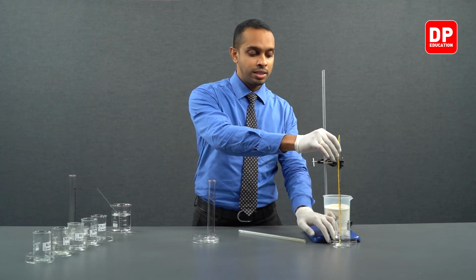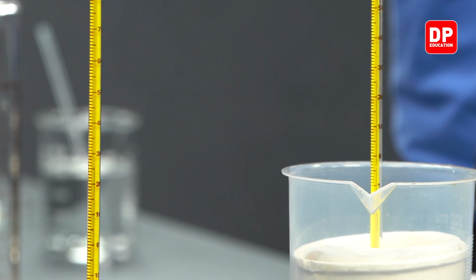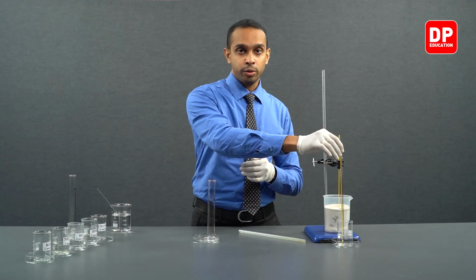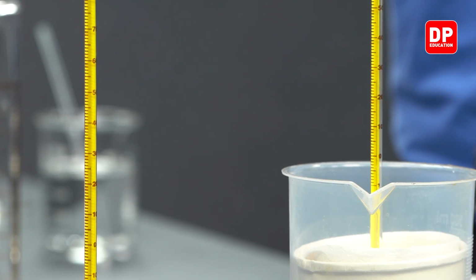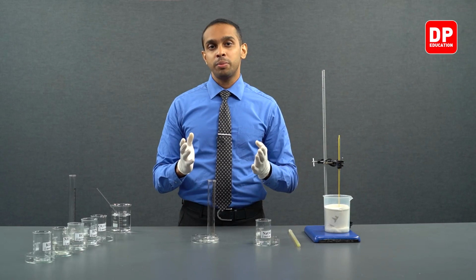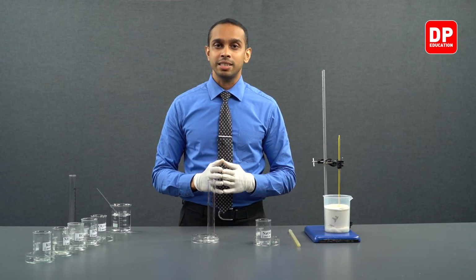You can see a side-by-side comparison of the two temperatures now. On your left hand side you have your weak acid, which is ethanoic acid. You can see the temperature of the ethanoic acid. And on your right hand side you have your base, which is sodium hydroxide, which is a strong base. We observe the temperature of ethanoic acid as well as the sodium hydroxide we are using for this reaction. Both were at 26 degrees Celsius.